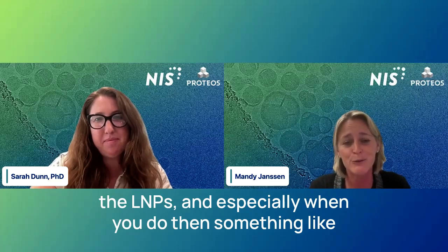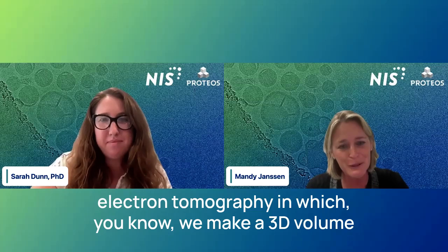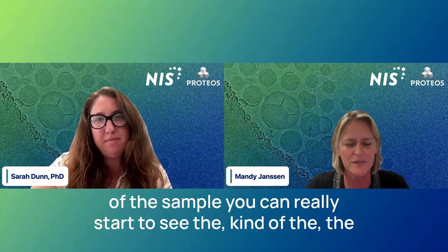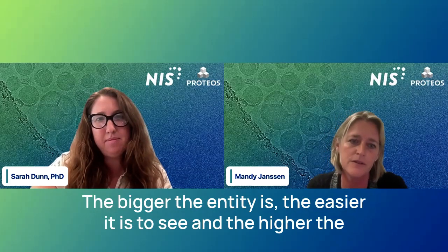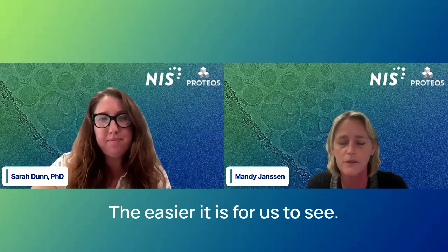And especially when you do something like electron tomography, in which we make a 3D volume of the sample, you can really start to see the coating around these particles. The bigger the entity is, the easier it is to see, and the higher the conjugation efficiency is, the easier it is for us to see.